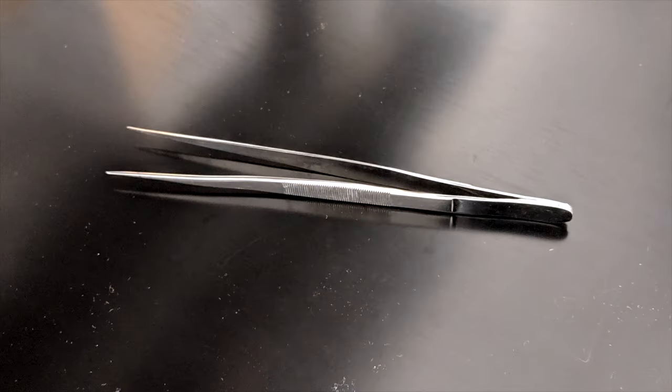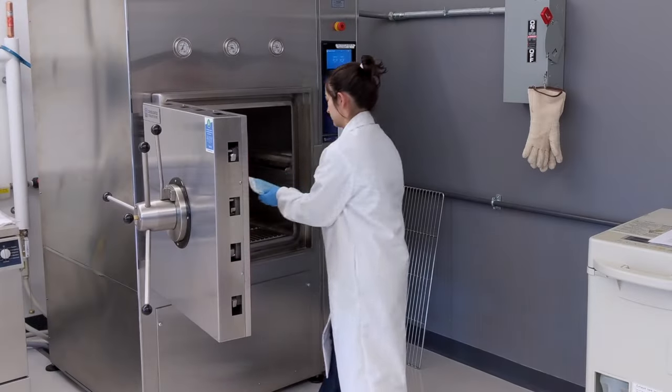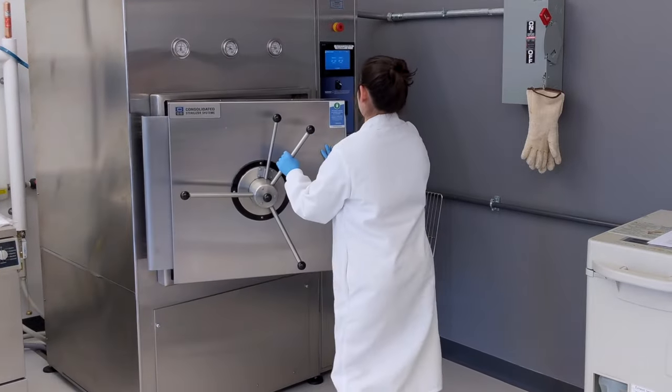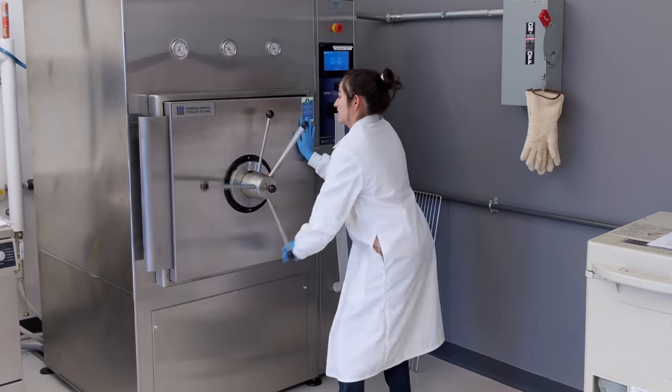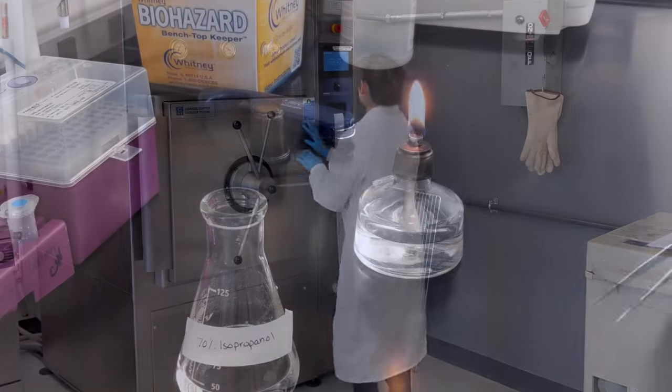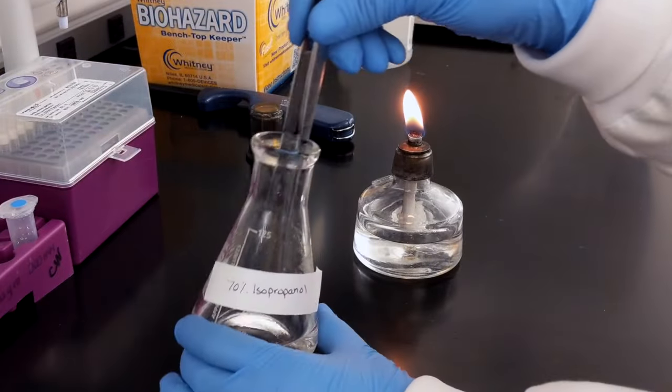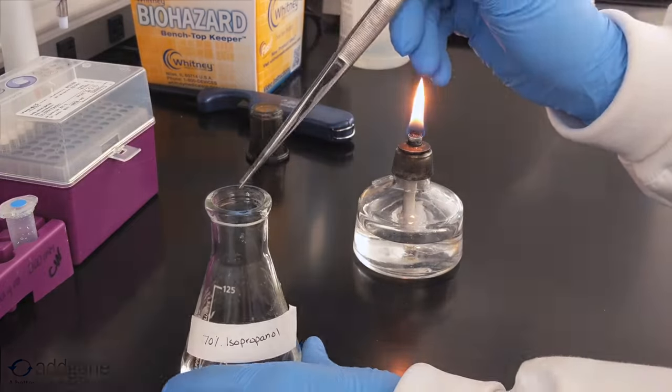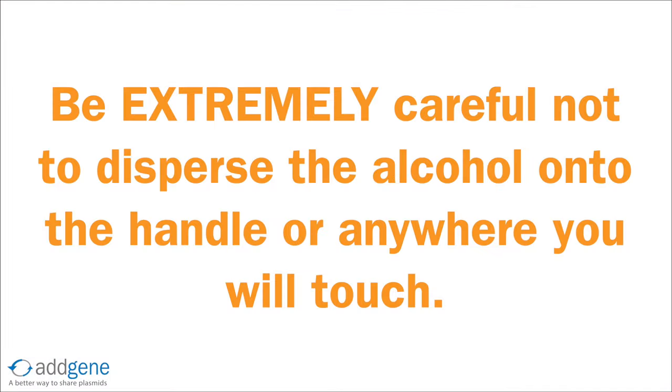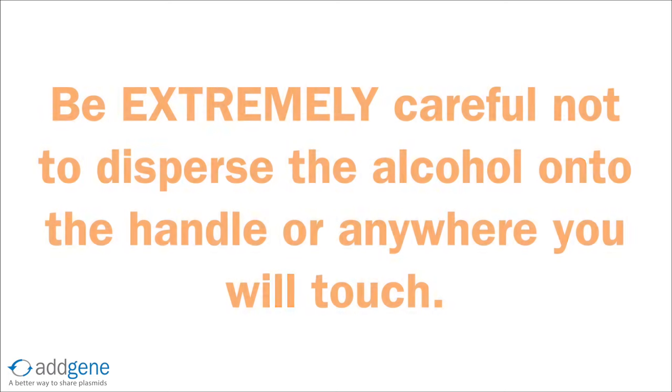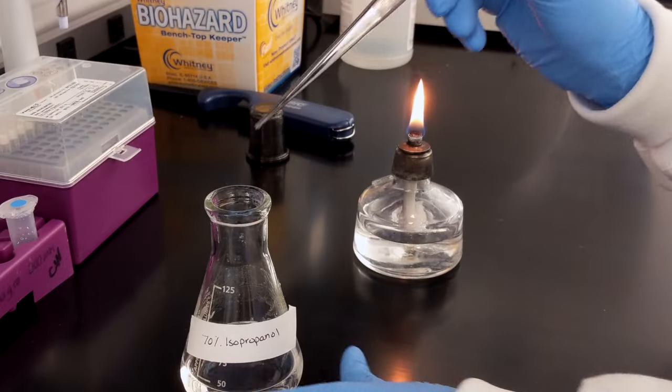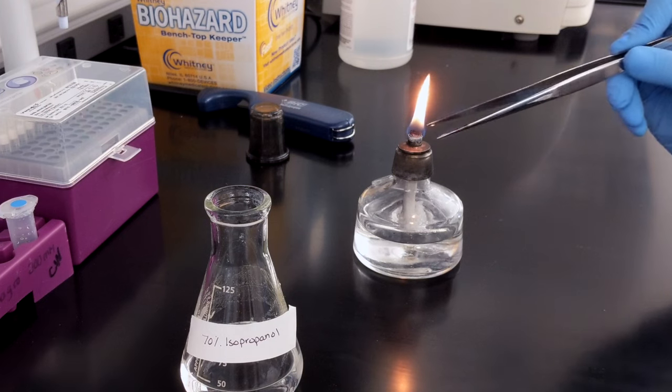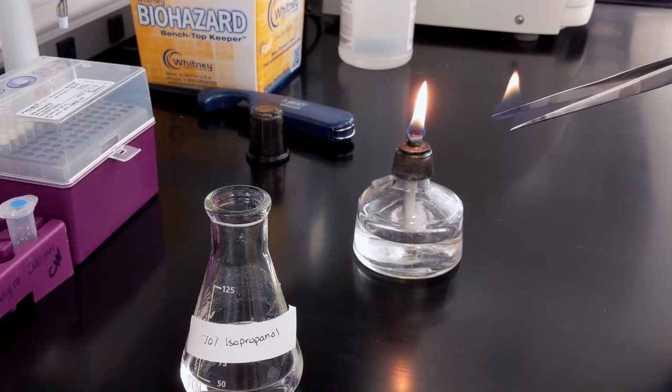Metal objects such as forceps and spreaders are used and reused frequently in the lab. While these items can be sterilized in an autoclave, it is often more convenient to disinfect with alcohol in a burner. To sterilize, dip the portion of the instrument that will be used for the procedure in 70% alcohol. Be extremely careful not to disperse the alcohol onto the handle or anywhere near the area that you will touch. Pass the alcohol-dipped portion of the instrument through the flame of the burner to ignite and then allow the alcohol to burn off.